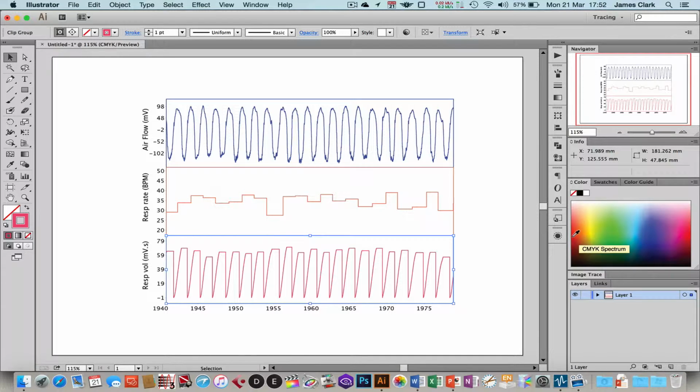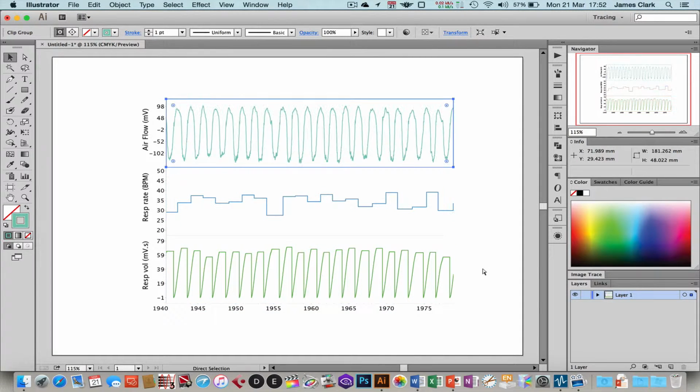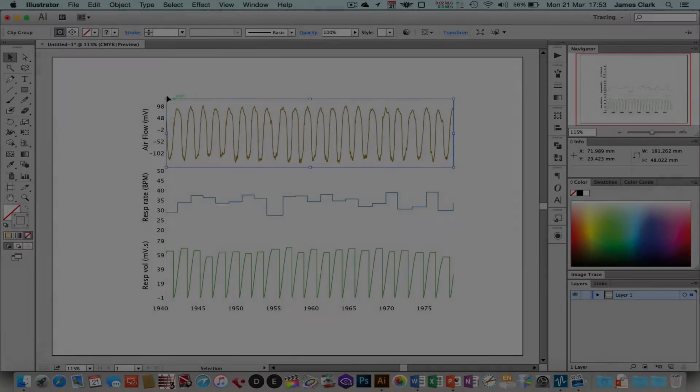Well, it's a bit too pink, there we are. A red color. You can do that really very simply and very quickly, and it all does it from within Illustrator. So Illustrator is obviously a lot more powerful. You can do a lot more with your image.